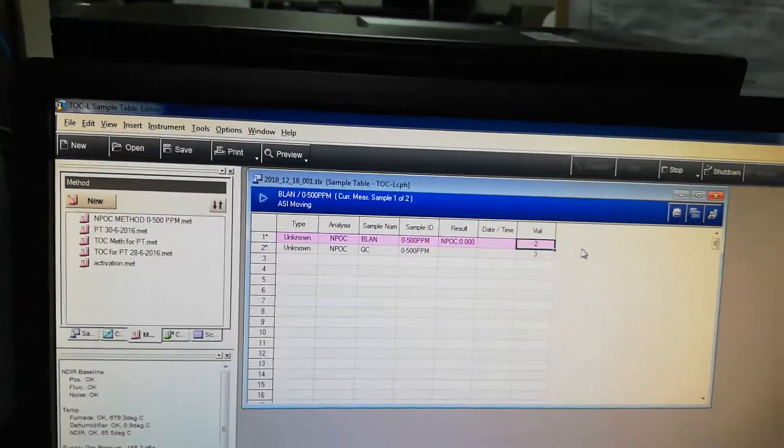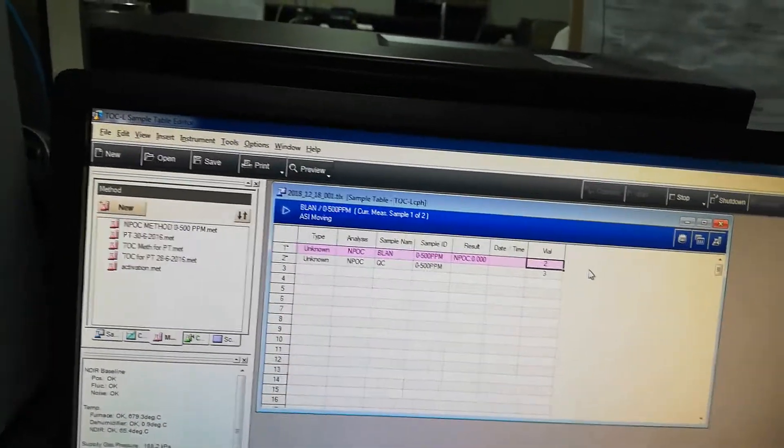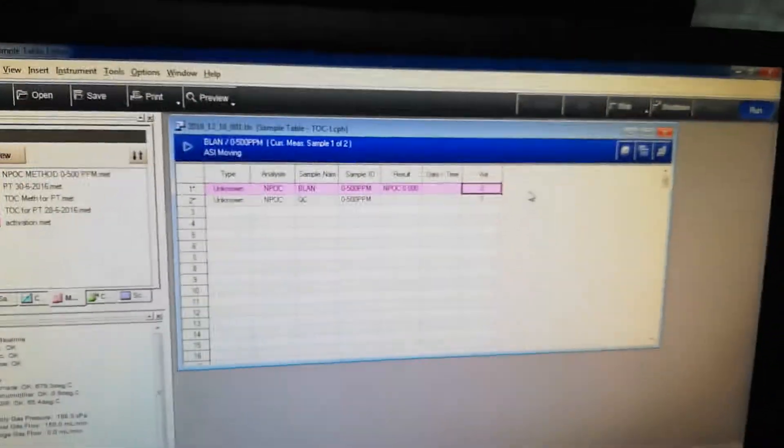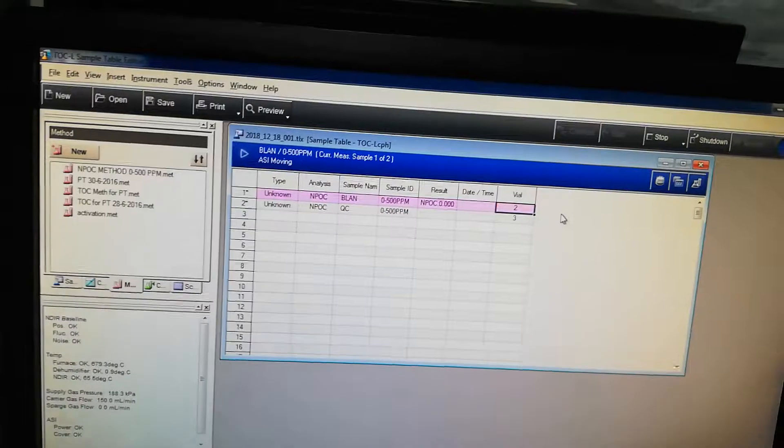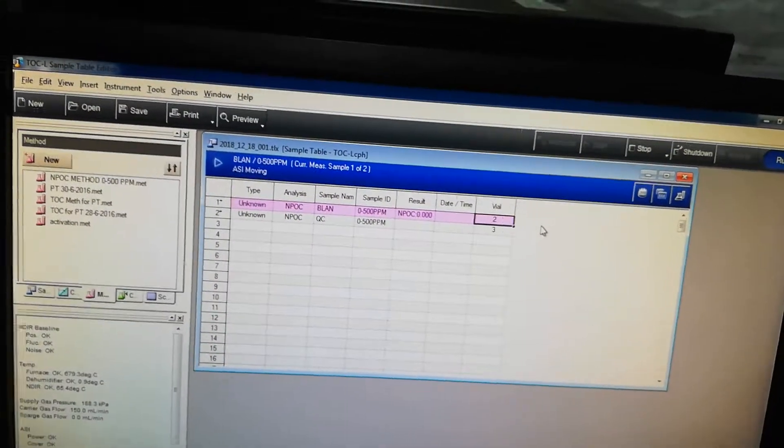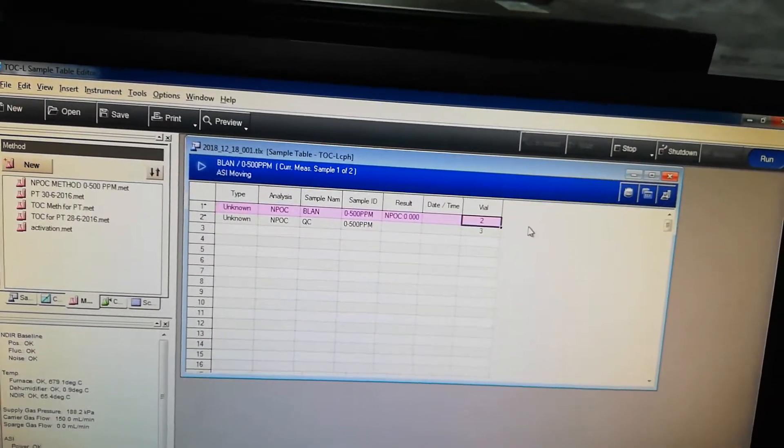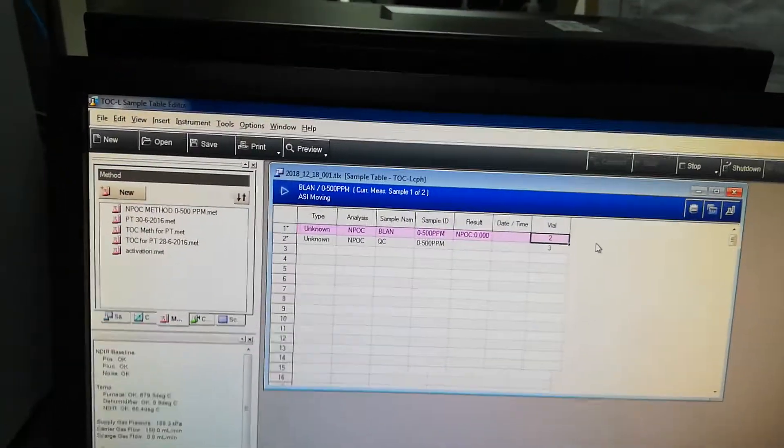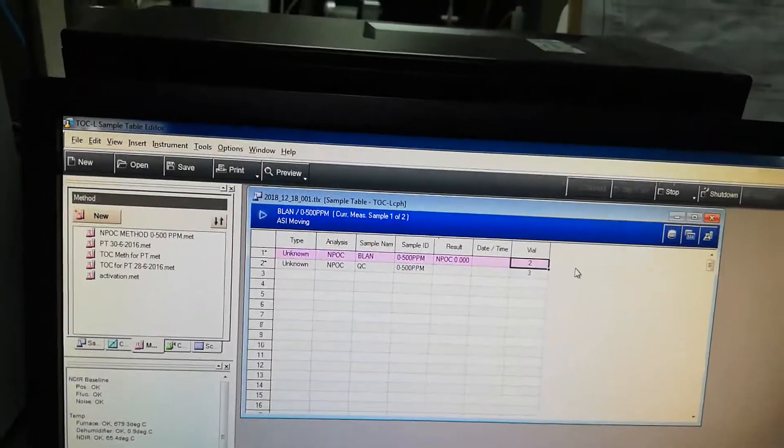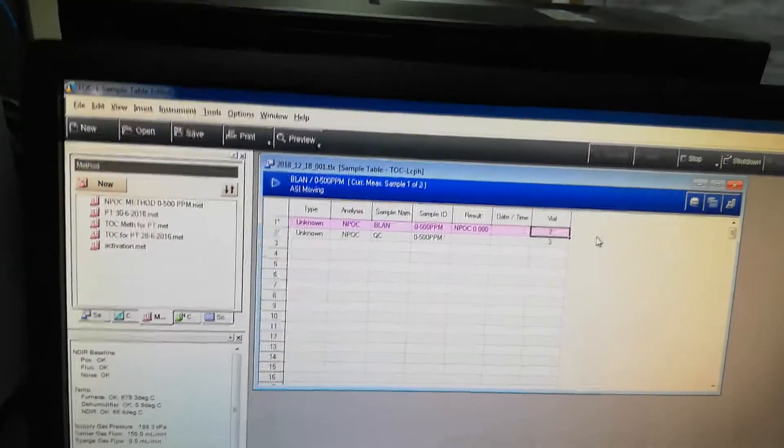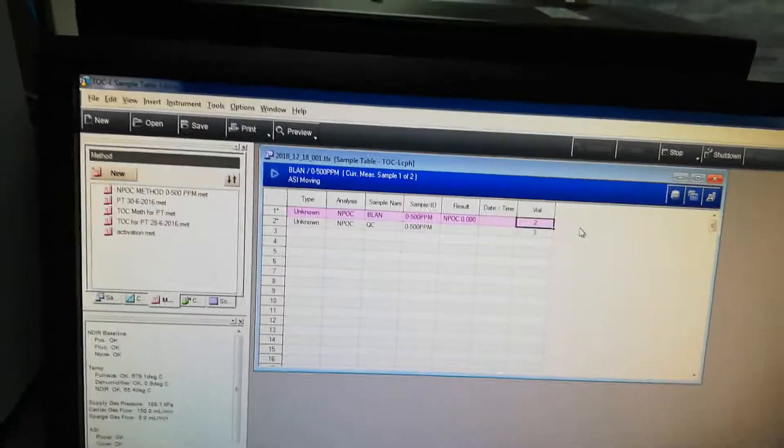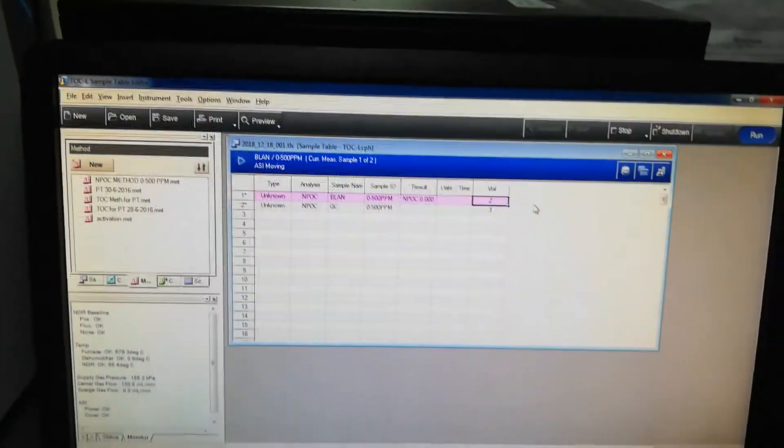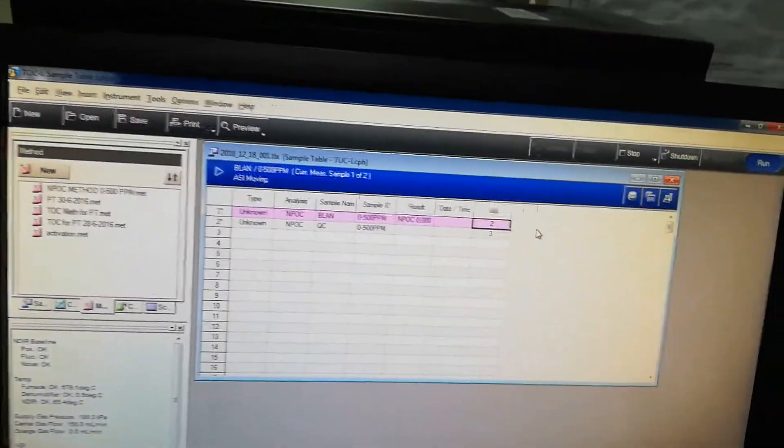Now here you can see there is highlighted that sample number 1, which is now ongoing analysis. Normally analysis time for one sample is around about 17 to 20 minutes. So this sample will be completed and then we will get results. So after this completion, inshallah, I will show you the step that how we will do the calibration of this equipment and different parts, and then I will also inshallah try to make some video on the method creation.